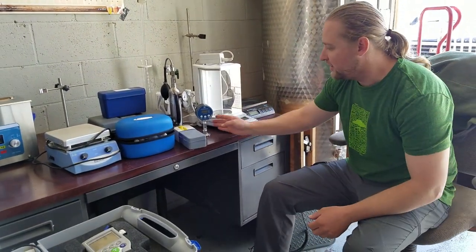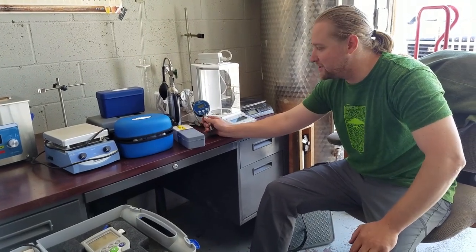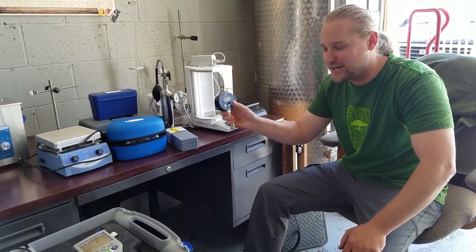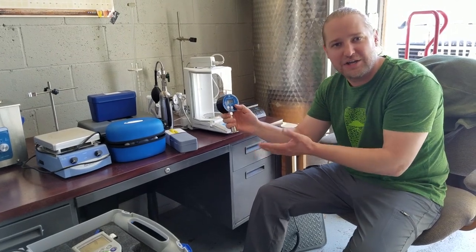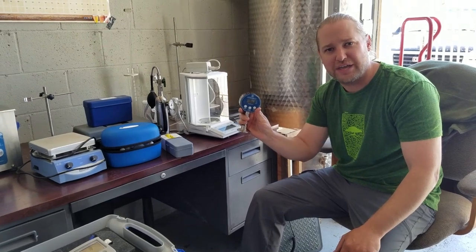Moving on, I think every brewery should have a master gauge for your pressure gauges. You can zero this out — it's accurate within a quarter of a PSI — so you can check your zomnagel and all your pressure gauges. Those things always drift, so it's really important to have a master pressure gauge to verify all your gauges.